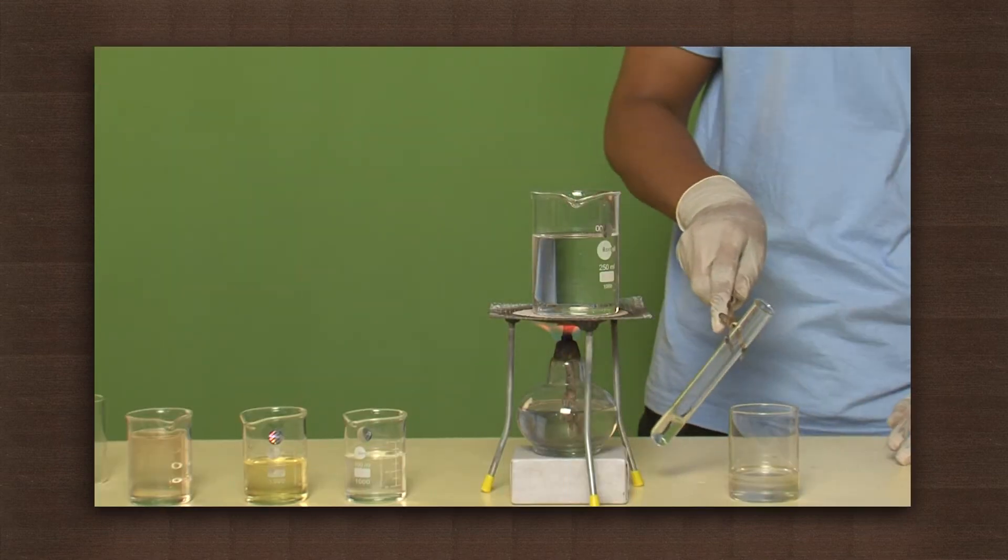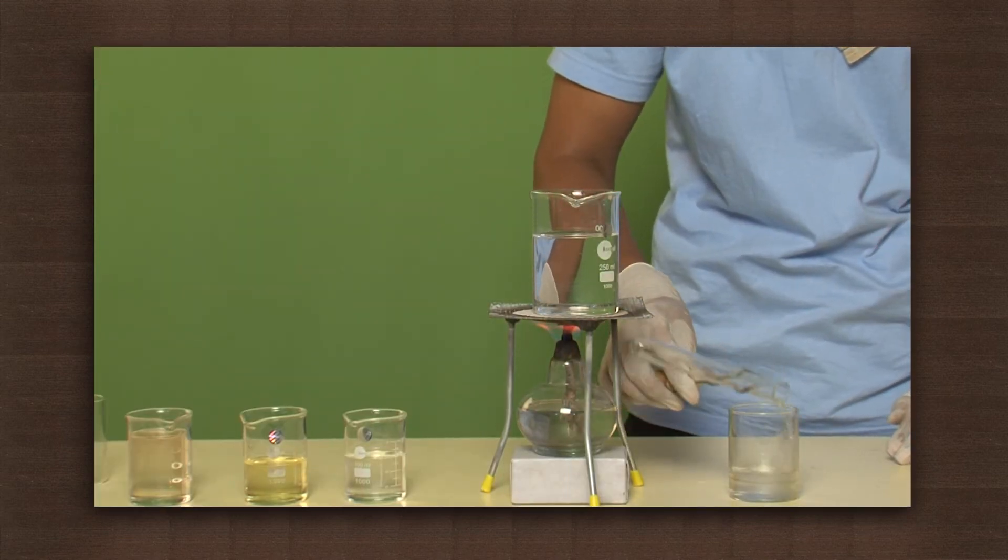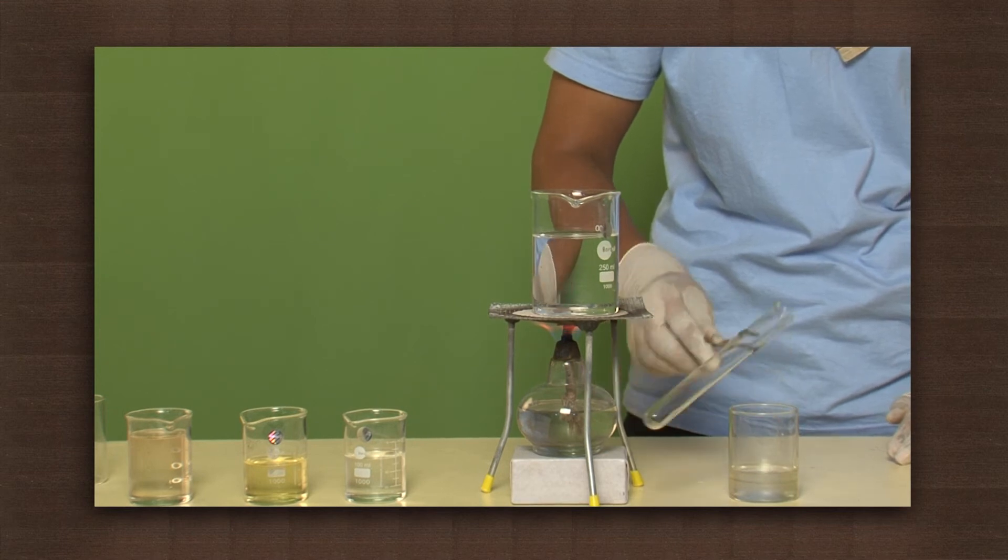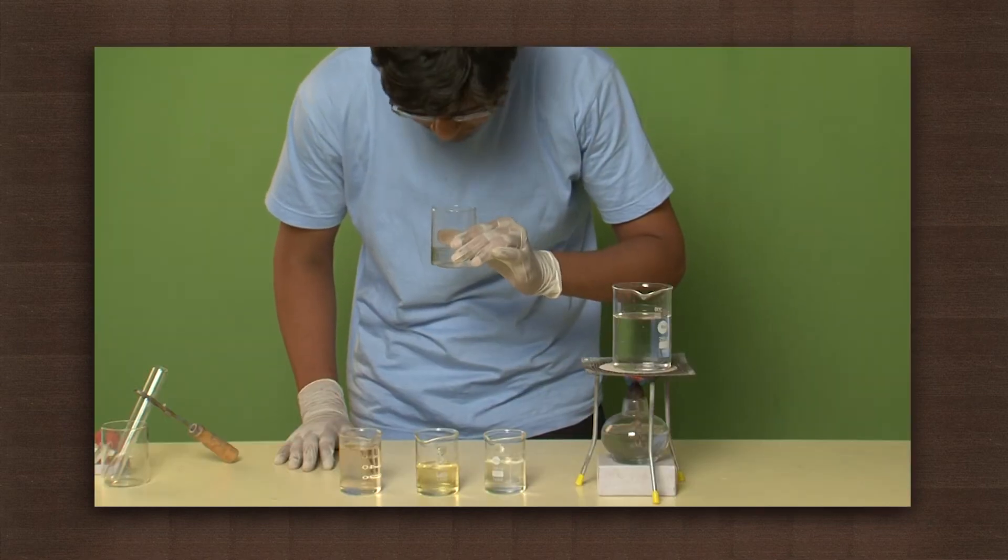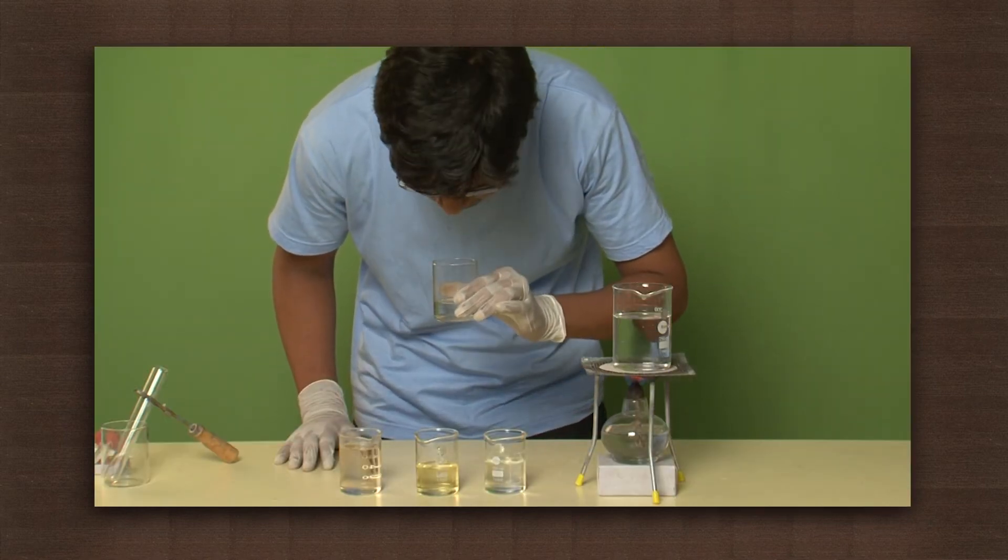After 2-3 minutes immediately cool the mixture by pouring it in some amount of water. Smell it, you will be able to get a pleasant smell of ester.